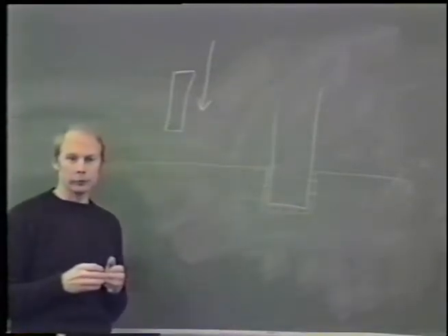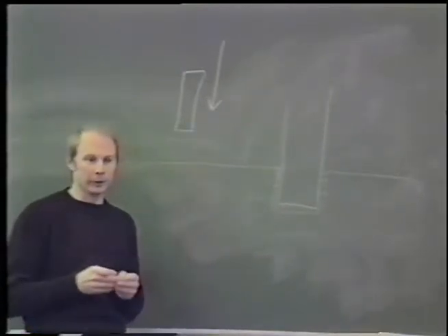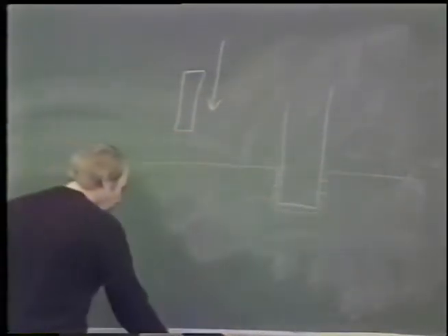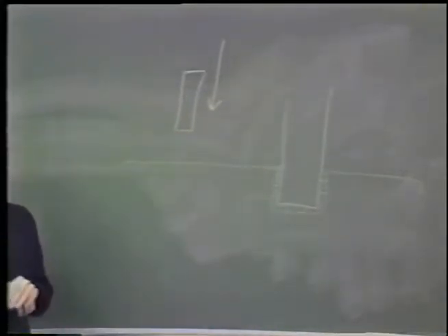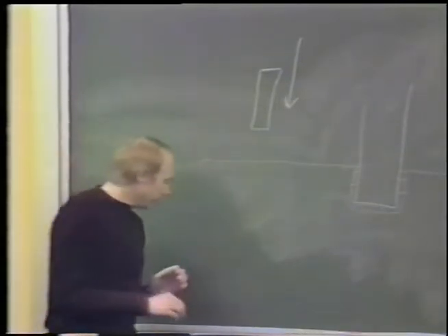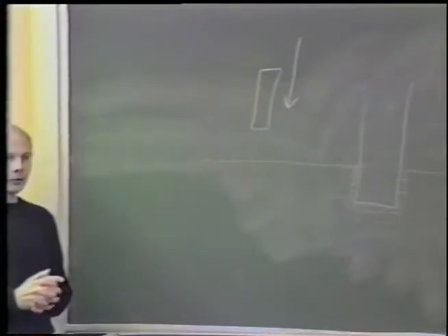You simply can't withdraw heat quickly enough to get good freezing in more than, say, the outer fraction of a micron of the sample. So what you have to do is somehow move the sample very rapidly relative to the cryogen to get rid of this barrier, sweep it away, as it were. You also want to use a cryogen that has a high boiling point and a low freezing point, so that you can absorb a lot of heat before the boiling occurs. And you want the cryogen to also have a relatively high heat capacity and high thermal conductivity.